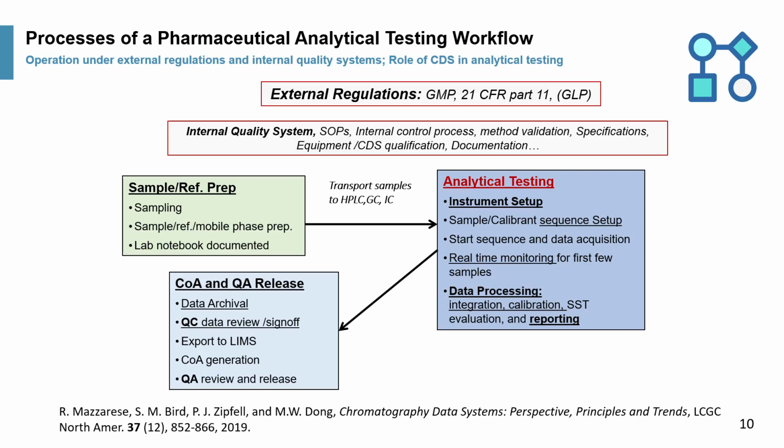This figure illustrates the process of a pharmaceutical analytical testing workflow, which operates under an external regulatory framework and also an internal quality system.